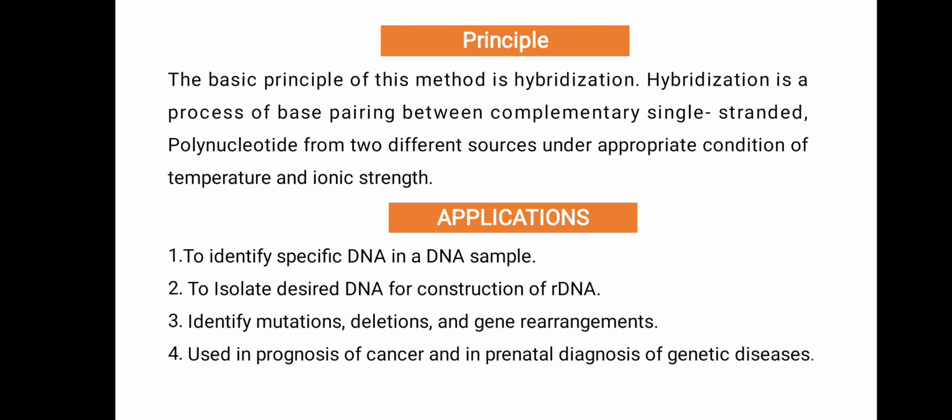Principle of the Southern technique: the basic principle of the method is hybridization. Hybridization is a process of base pairing between complementary single-stranded polynucleotides from two different sources under the appropriate conditions of temperature and ionic strength.